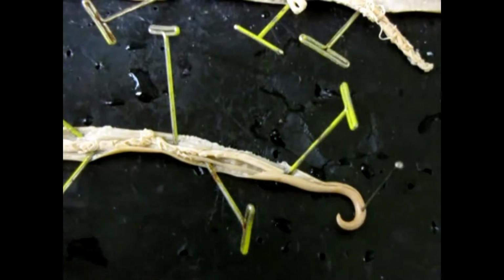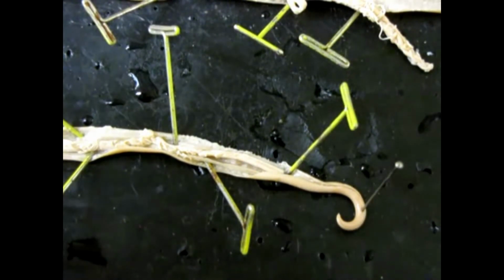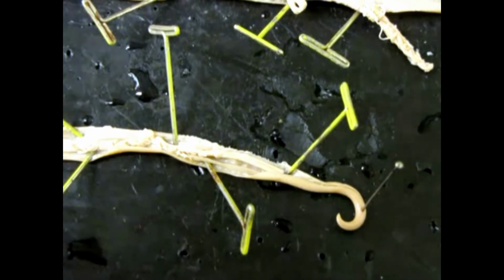Now we'll look at the male, and just be aware that I have flipped it so its anatomy is reversed in terms of its orientation.